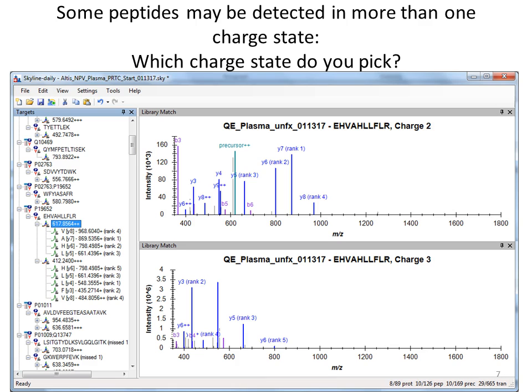And so, for example, a Y3 ion here is 1, 2, 3. It's FLR. If you did a database search and you looked at how many peptides ended in FLR, there would probably be a lot. They may not chromatographically coelute with that one and it may not interfere, but why risk it if you have all those other ions to choose from? Now in some cases there are peptides that are really short, and so a Y3 ion is something you are stuck with, and that's okay.